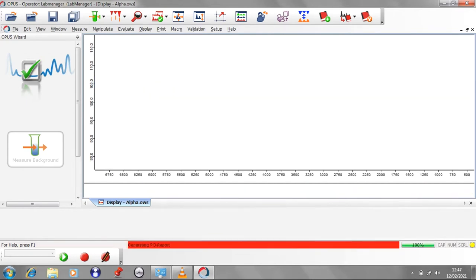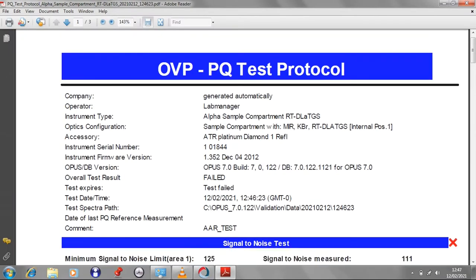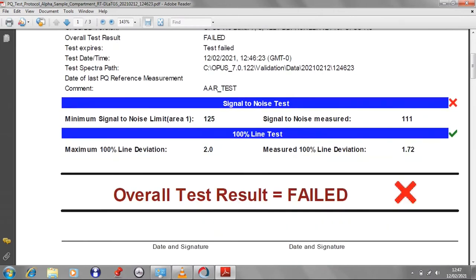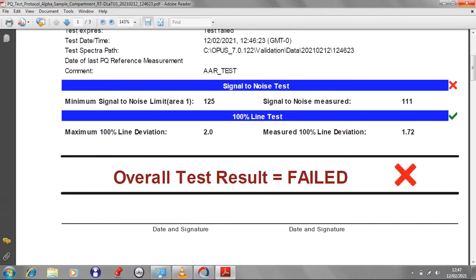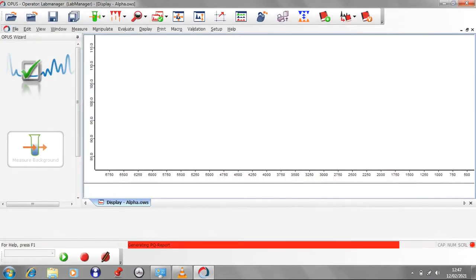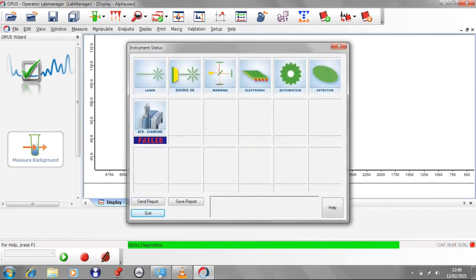It's possible for some of these tests to throw up issues or even a failure the first time they are run. For example, here a failure has occurred and a PDF reporting the fault has opened. You can just close this document. The circle highlighted here will show the results of the test. If it's green, you can move on to the next section of this video. If it's yellow or red as it is here, click on the circle and a diagnostic results window will pop up.